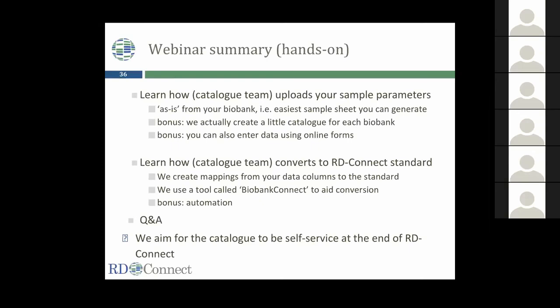And it's important to notice that at the end of the RD Connect financing, we can't spend as much time on it to support you as we can now, unless we get other financing. So make use of the remaining time of the RD Connect project to get support in getting your data into the catalog.